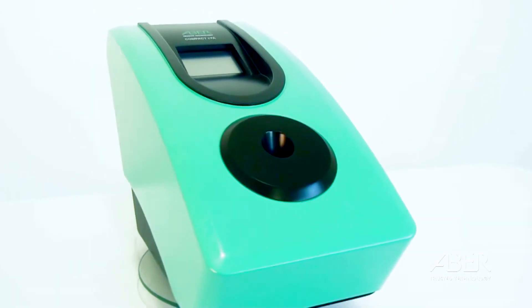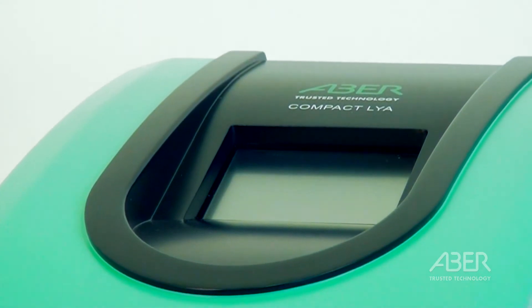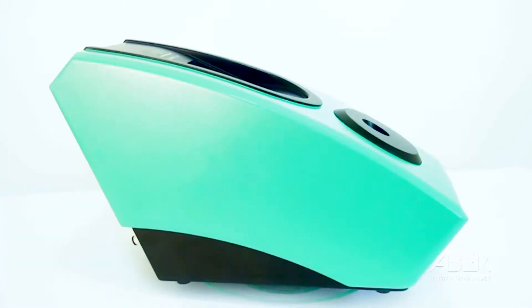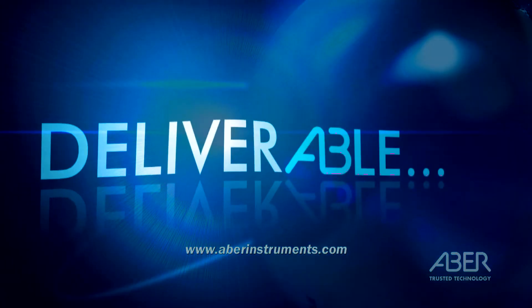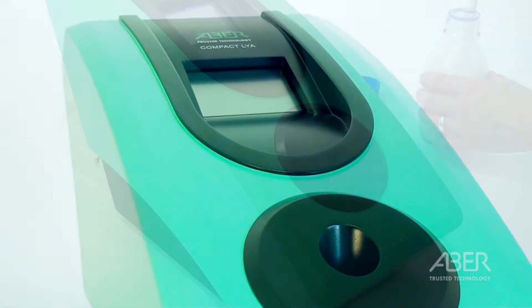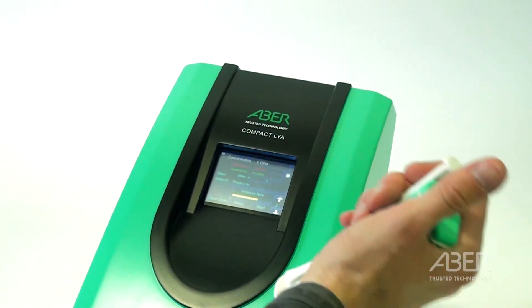The Compact Lab Yeast Analyzer allows viable yeast concentrations to be measured in seconds with high precision and repeatability. It can free up time and reduce errors by eliminating dilution and manual counting under the microscope. The instrument has been designed to be used by process operators, so it can be used when the main brewery laboratories are unmanned.